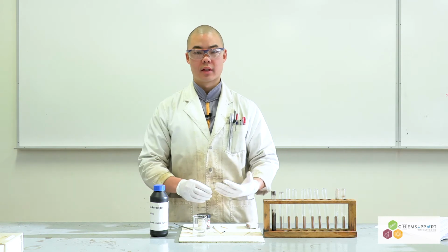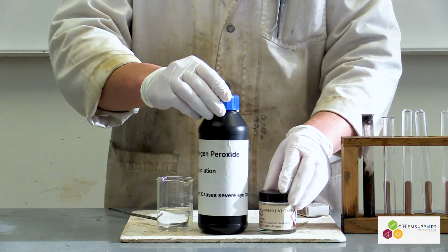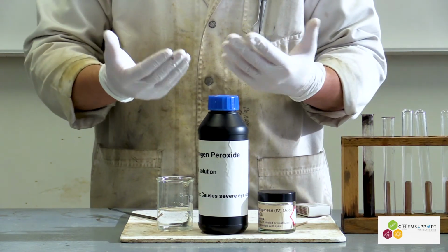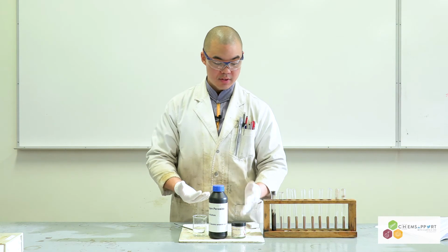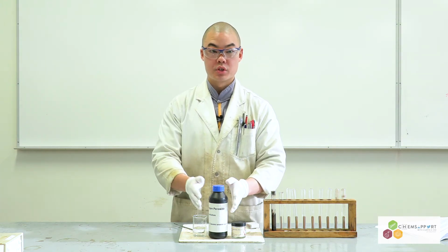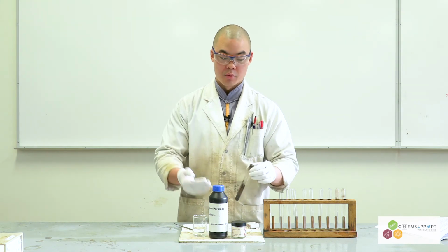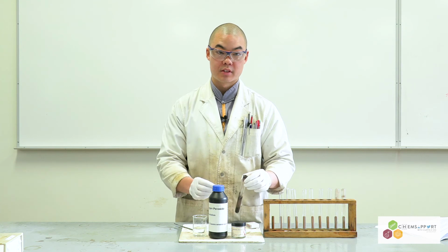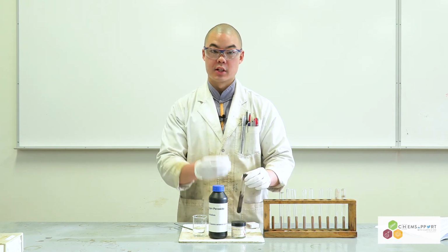So we can start to think that both these reactants, manganese oxide and H2O2, or hydrogen peroxide, have a lot of oxygen in them. So what's really happening in this reaction? What is decomposing? We can start to see that this manganese oxide is catalyzing the decomposition of hydrogen peroxide to produce oxygen gas. And we saw that from the glowing splint experiment, where we put the glowing splint in there and it reignited that splint into a flame.